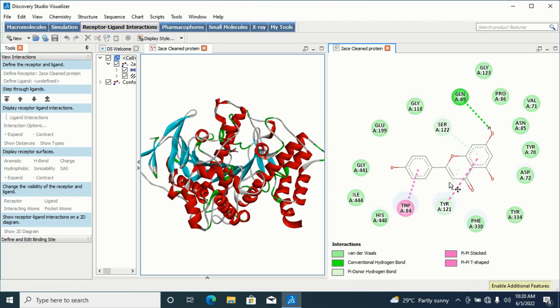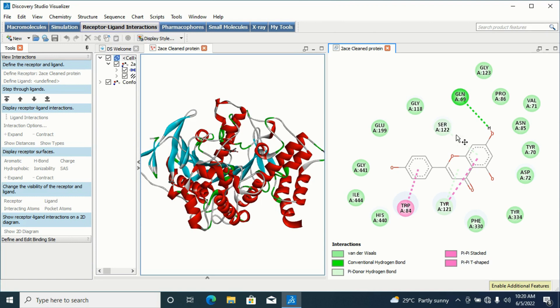This second conformation involves a hydrogen bond here — this is a conventional hydrogen bond, which is one of the strongest hydrogen bonds in 2D diagram display. The conformation with the highest number of hydrogen bonds at the active site gives you a better and more stable interaction. We always choose that one in preference to others.